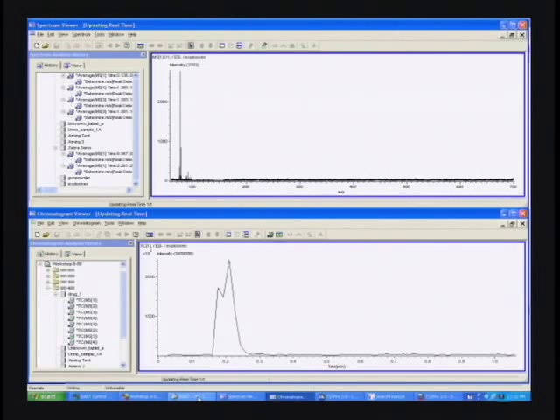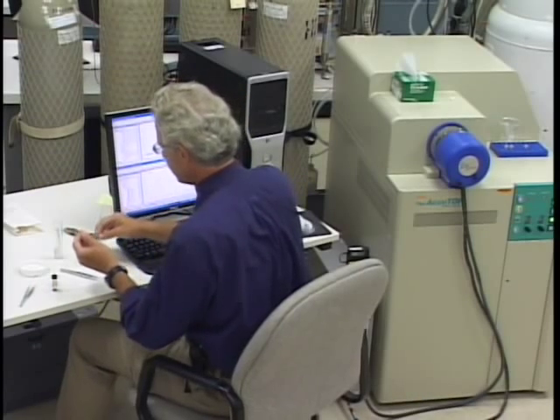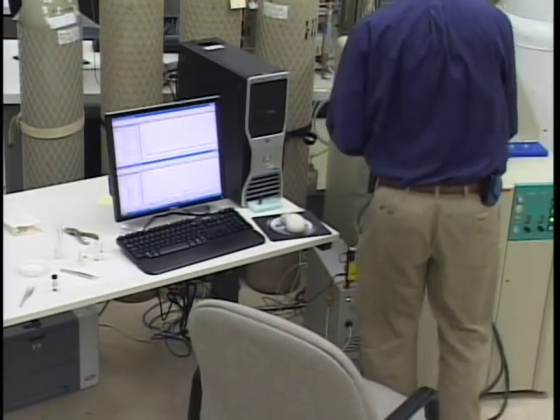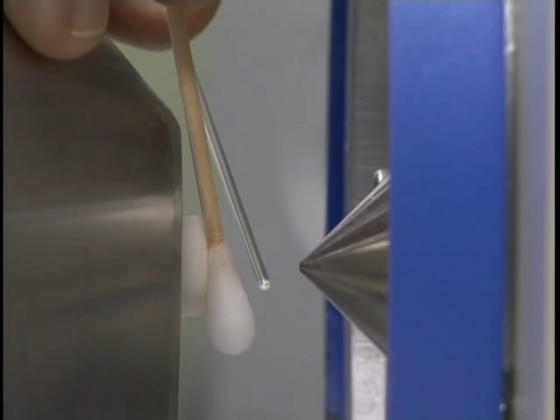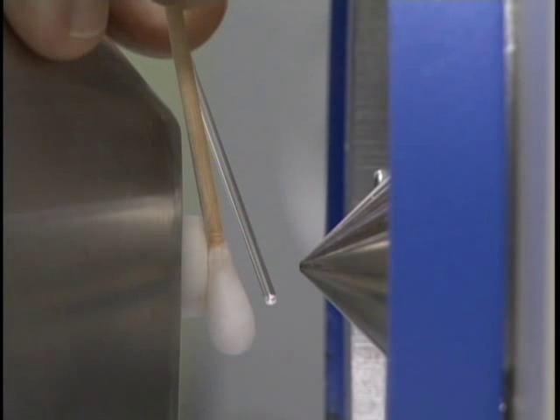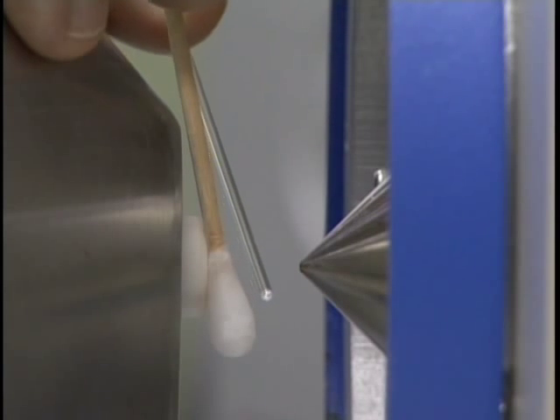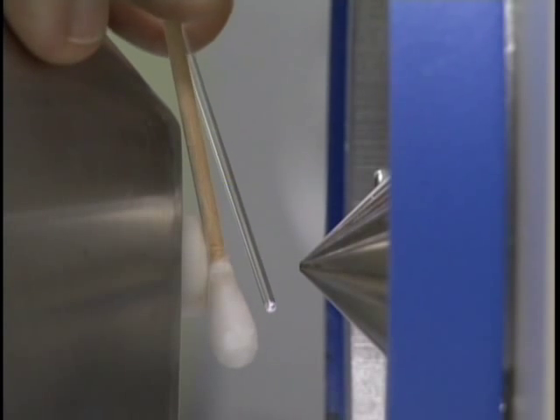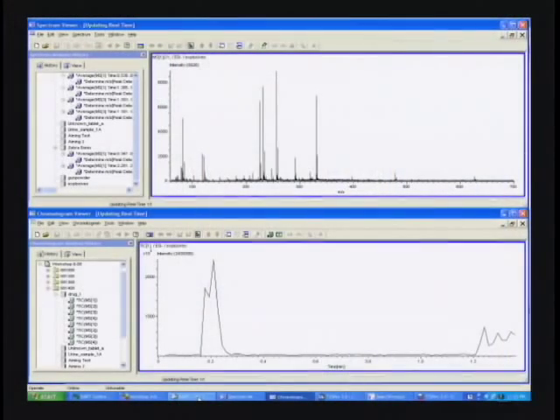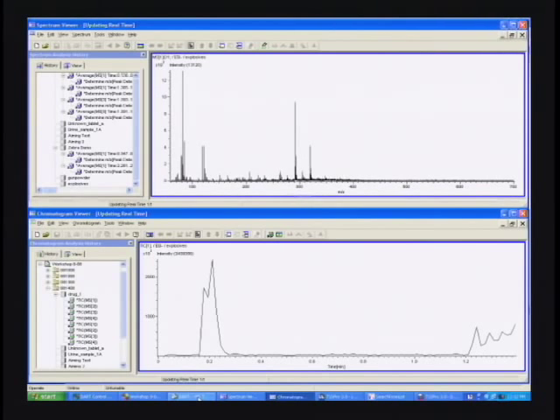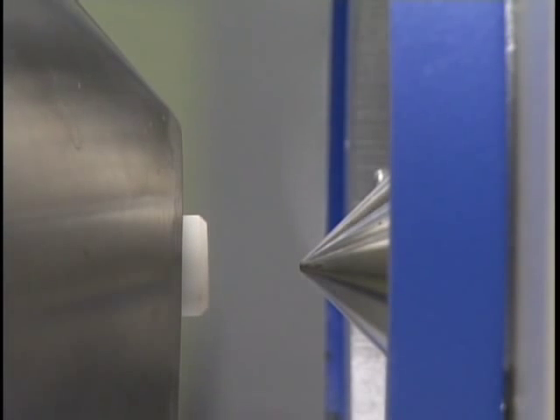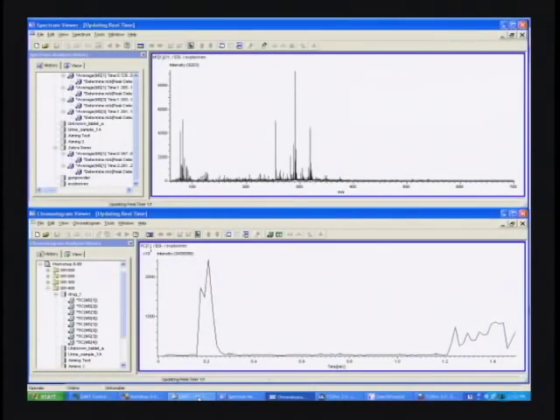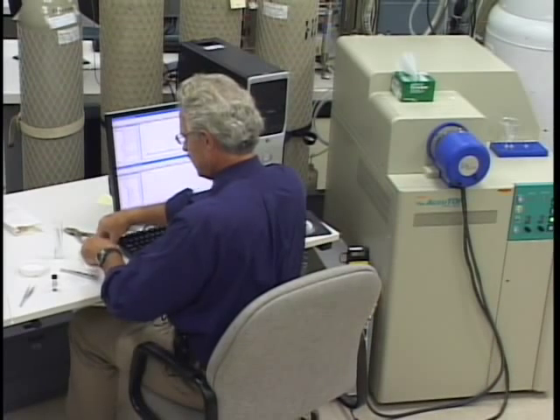So here's the sample and here's the methylene chloride. We'll go over here and just hold this in the gas stream so there's a little bit of methylene chloride vapor there. And we'll put the sample in front of it and just watch what happens. That's done.